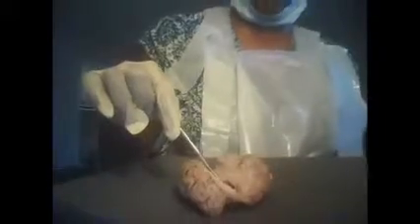The cranial nerves, which you have several that operate different senses in the body. The oculomotor, the trochlear, the trigeminal, and the optic would all be in the ventral area. Let me see, somewhere in there where I'm pointing.